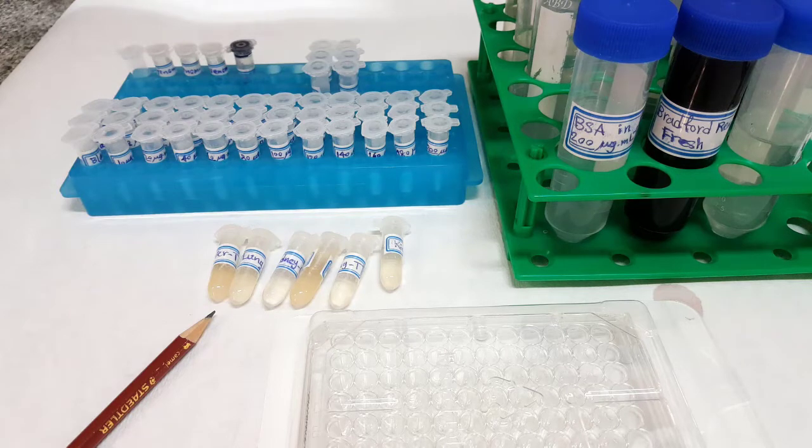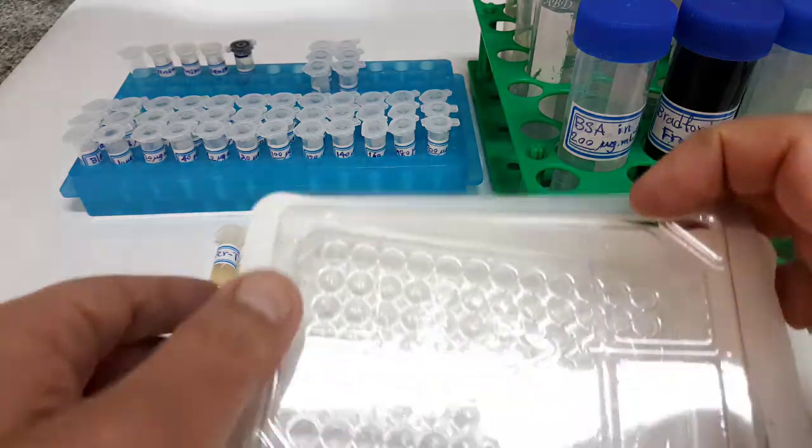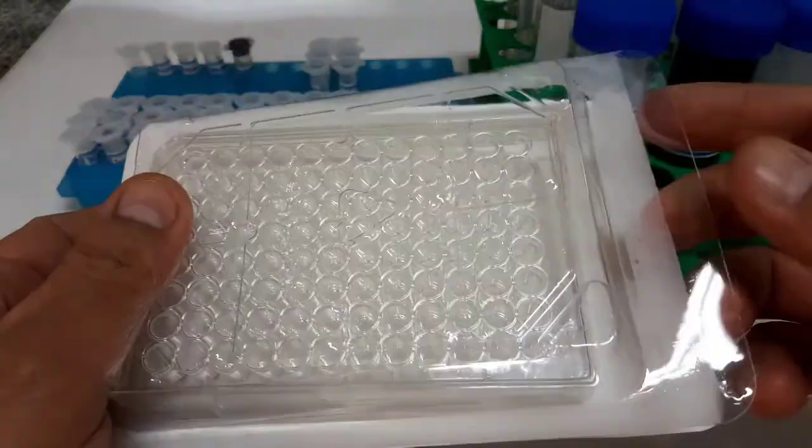Please pay attention that appropriate dilution with PBS may be necessary to fall the absorbances of the samples within the linear part of the standard curve. I diluted liver supernatant 50 times due to its high protein content and those of kidneys and lungs 10 times with PBS. I used a 96 well plate for measurement of absorbances of the prepared samples.